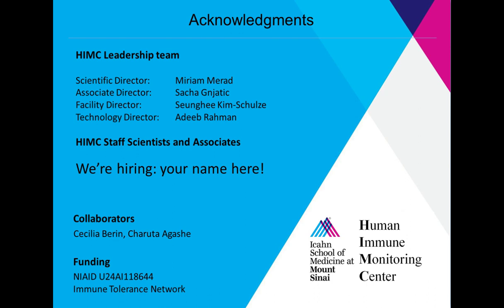The first question is, are there any downsides to antibody panel lyophilization? Sure. I guess there's two primary downsides. One is cost. It isn't cheap, at least to lyophilize these things commercially. It does scale very well with volume, so this wouldn't really make sense to do in a study where you only have 50 or so antibodies or 50 or so vials that you need to lyophilize. But when doing several hundred or thousands of tests, this does become fairly more cost effective.